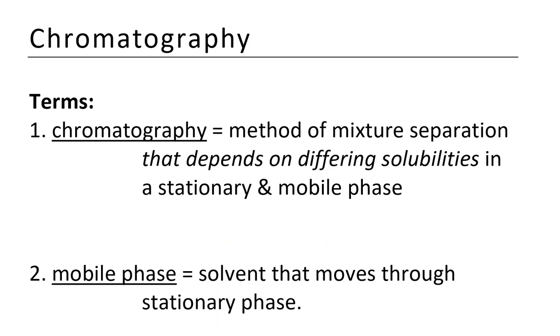Chromatography is a method to separate a mixture, and you may have seen it on TV before when you're watching a crime show where they analyze some mixture, maybe a gasoline found in somebody's garage, and it has a certain pattern of peaks, and then they analyze the gasoline that was found at the scene of the fire, and it matches, and they say, oh, this gasoline from the garage had a common source, and so they can spot that they're the same mixture.